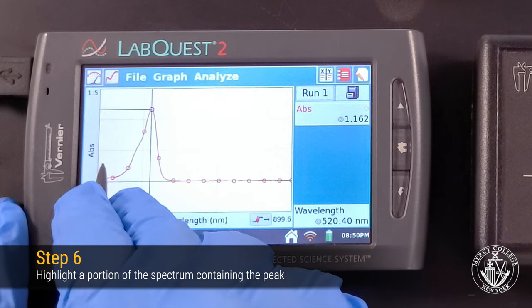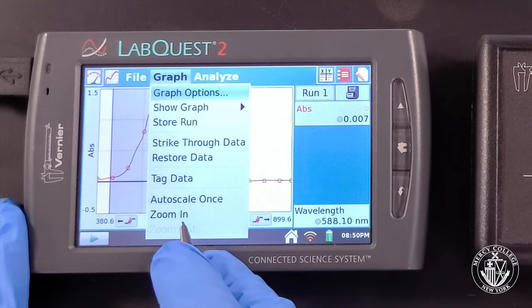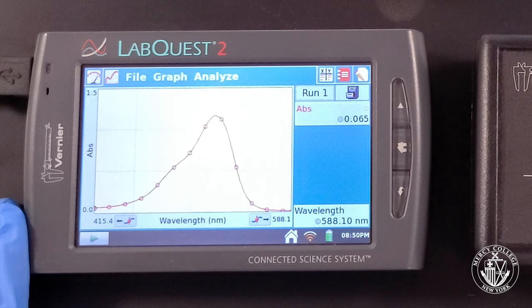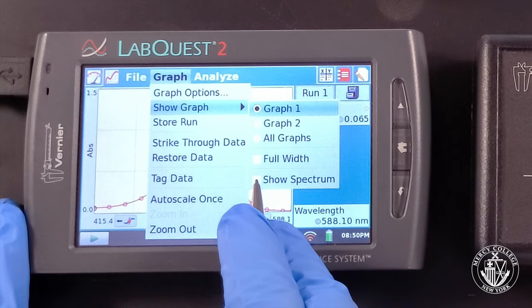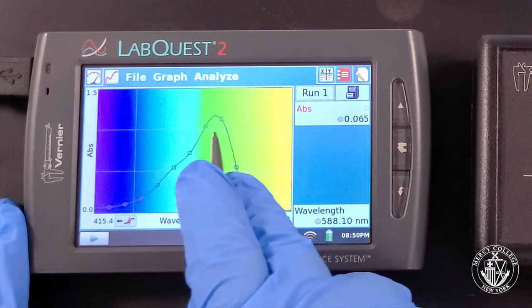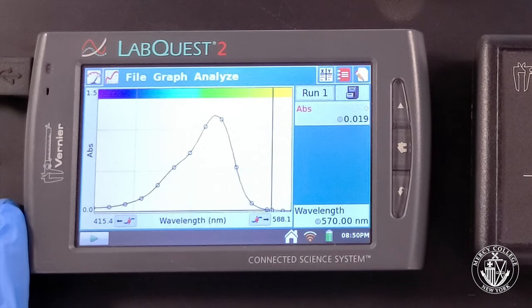To see more detail on your collected spectrum, highlight your data and select Zoom in from the graph menu. To see which colors your sample is absorbing, select Show Graph and Show Spectrum from the graph menu. This allows us to clearly see the absorption in the blue-green region of the spectrum. Double tapping at the top of the graph will shrink the color spectrum.